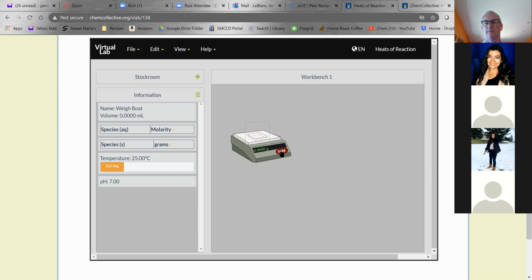And if I do the experiment in the real lab, what's the issue that I'm going to face? Yeah, what do you think would be the issues? Like here, everything works perfectly. What would be some sources of error, do you think? Would they be determining the masses? Would they be measuring the volumes? Would they be determining the temperatures? What do you think would be the biggest problems getting really precise answers? Temperature?